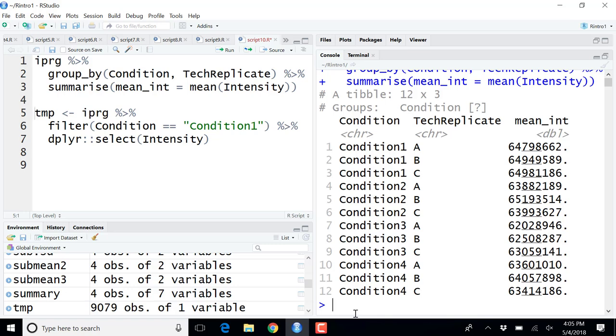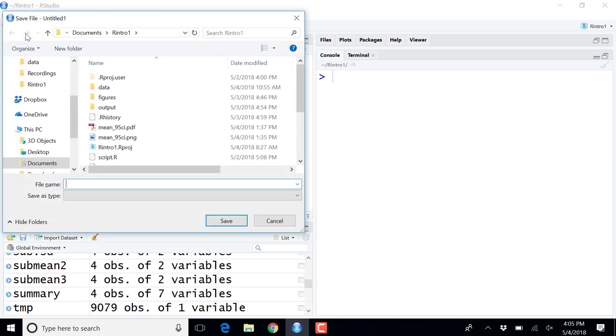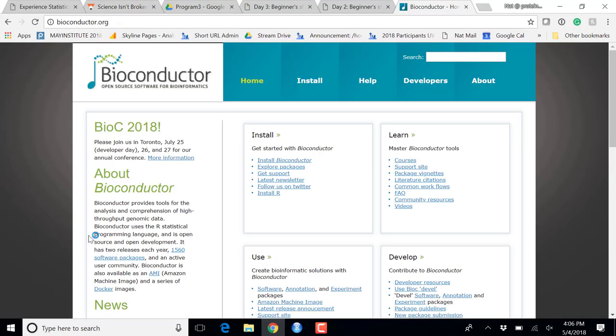Okay, so we have two last topics to cover before. Is it 5 or 6? 5. Okay. Yes. And so one of them is to give you an idea of other software that can be used, specifically software that is designed specifically for mass spectrometry or proteomics. And these software would generally be found in a project called Bioconductor that I think I already mentioned.